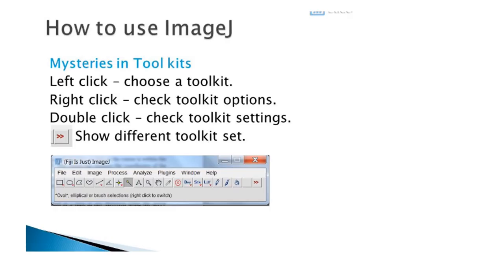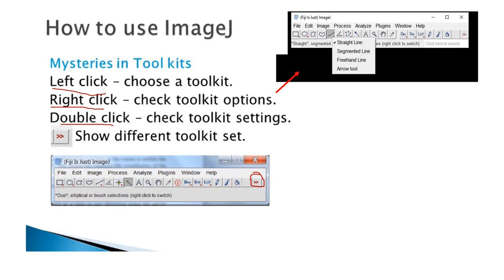The first thing I want you to do after you install ImageJ is to play with it. Go there and try to play with the left click, try the right click, and try the double click. If you have never used ImageJ, they do slightly different things. With the left click you will choose a line, with the right click you can make a straight line, a segmented line, a freehand line, or an arrow. Just try it, and maybe on your computer it works a little bit differently.